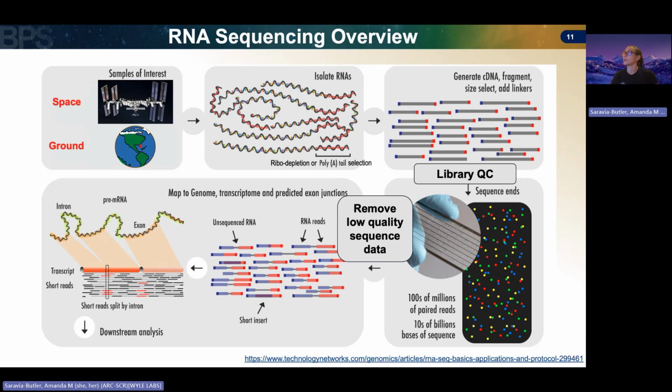After you have your library successfully constructed, very critically, you're going to perform your library quality control assessment. If you recall from the sequencing lecture of the GL4U module set, we are checking for 2 things during library QC. We are checking to make sure we do not have primer dimers.